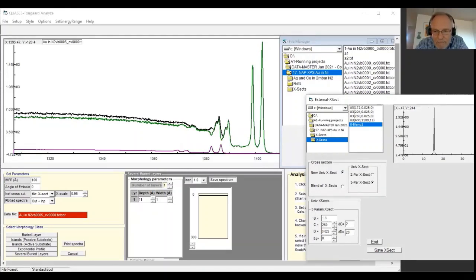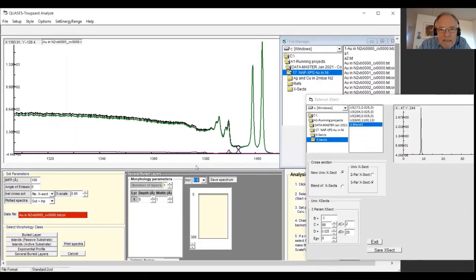And I just change the position of this. Maybe it's about 100. We have an increment of 2 here, so I move this down. So it fits more or less here. It fits more or less there. We can see if I change this. So this is where the small peak is. It needs a very small intensity here, but here it is, about 1 or 2 here. But we'll adjust this weight, of course, later.